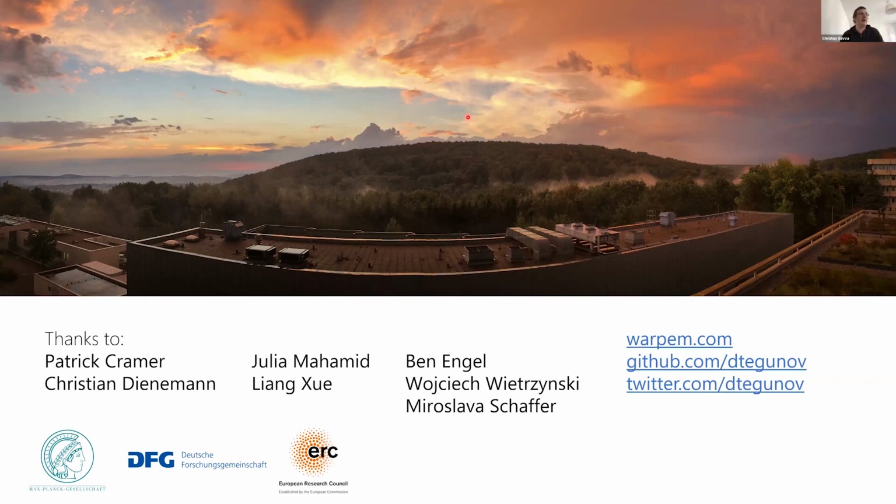Okay. A couple of similar questions from Liz Kellogg and Katerina Nadinova. Can you see what kinds of deformations are dominant contributors to the loss of image resolution? Is it doming or warping? Which of those motions do you see more prevalent?